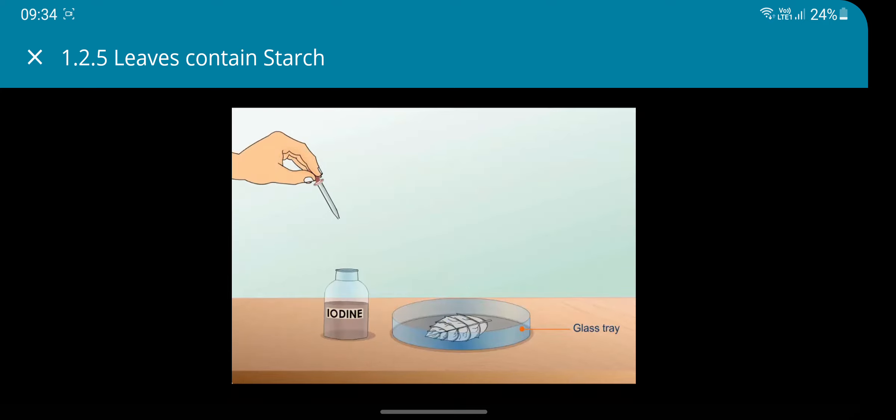Place the bleached leaf in a glass tray and pour iodine solution over it. The color of the leaf changes to bluish black, which indicates the presence of starch.